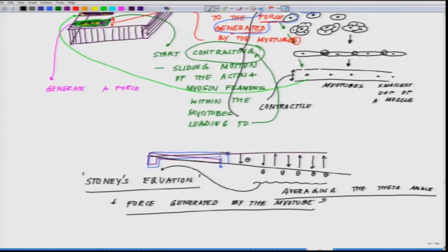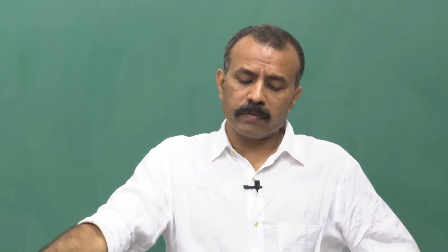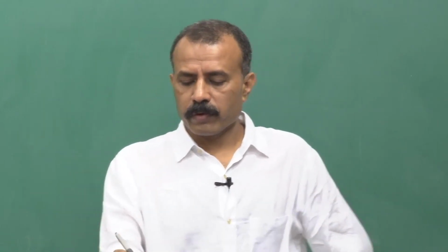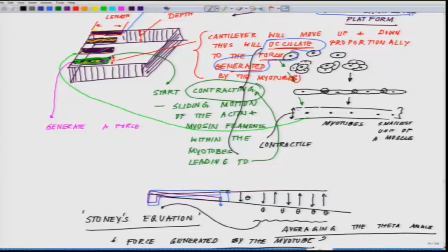You will see it is approximately close to the force generated, because this is the value you are getting for a single myotube of a finite dimension.